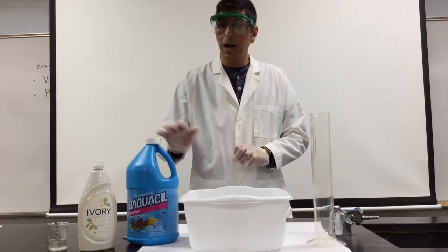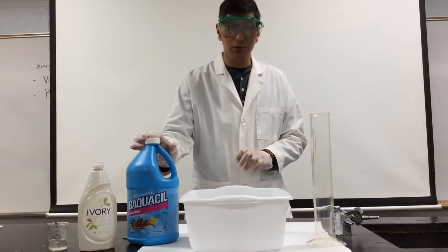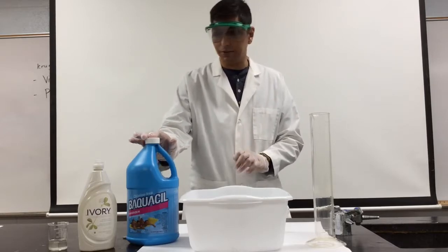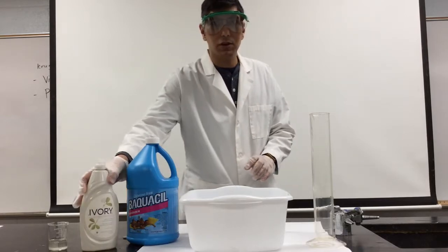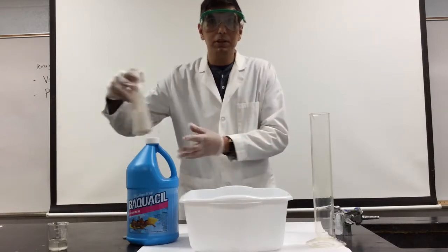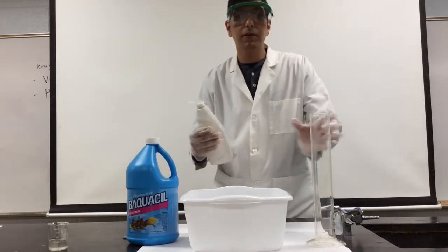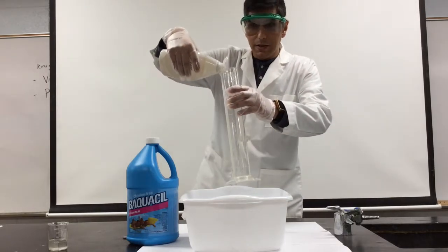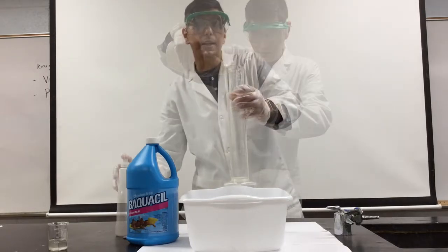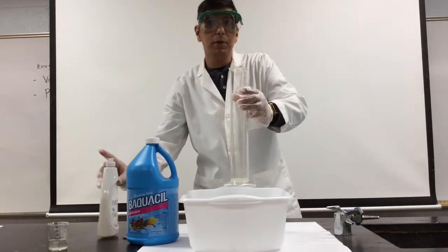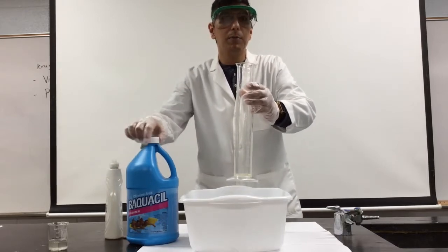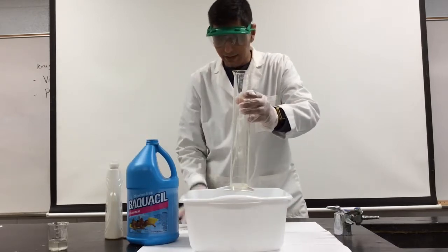By the way, I bought this at the pool supply store where it's sold as Baquacil pool oxidizer. Now, I'm going to start the reaction by putting some soap in the bottom of a graduated cylinder so we can see when the bubbles are produced. Next, I'm going to add about 200 milliliters of the Baquacil hydrogen peroxide.